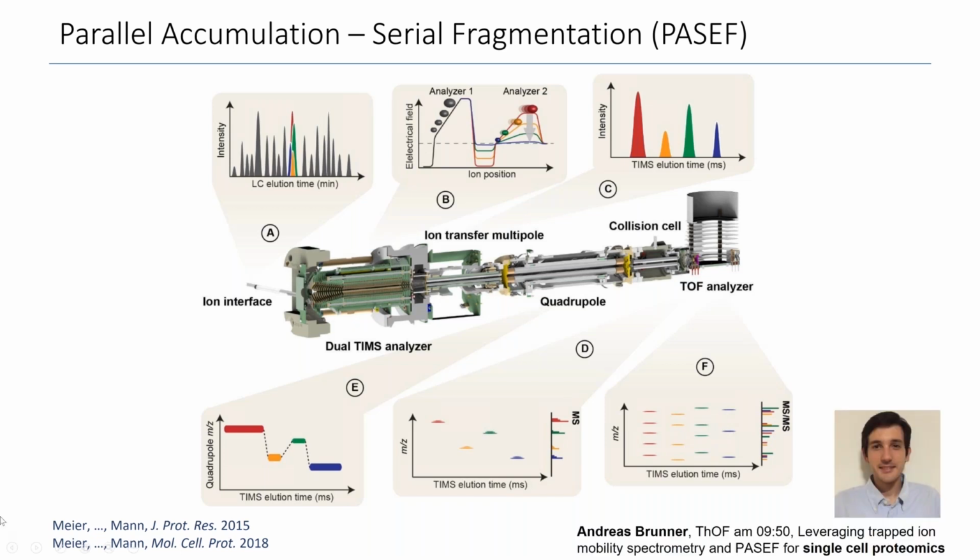And we're really excited about this technology, and you can hear more about this also at this ASMS. One talk that I would like to highlight is the talk from Andreas Brunner, where he's going to talk about how we can leverage this technology now to reach very high levels of sensitivity, down to the level of single cells. So I can only recommend watching this talk.